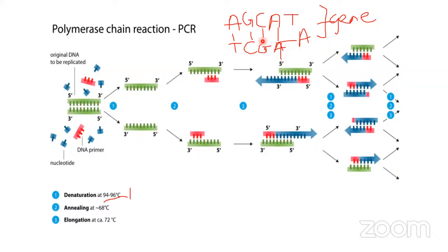Those are the molecules in molecular diagnosis. So now, these are what you call the nucleotides. So in a PCR reaction, you have one, the DNA, two, the primer, three, the nucleotides, and then you have the Taq polymerase that is going to join them together. So let's look at what happens here. When you heat this up, it separates. It is called what?